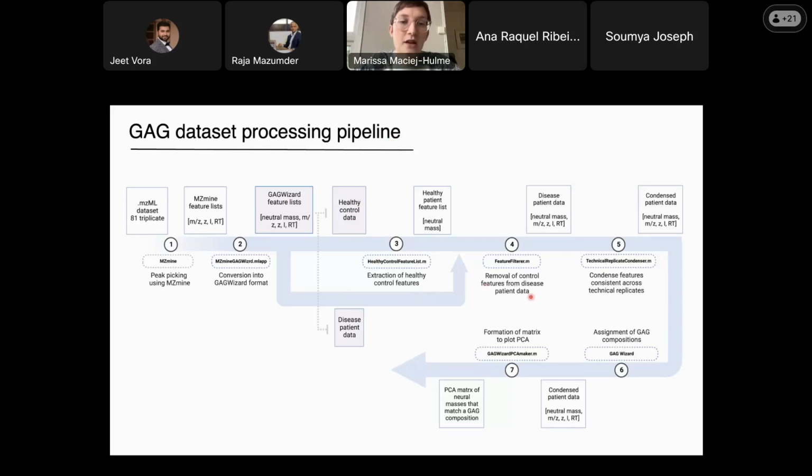So once we'd done this, we then condensed our data down. At this point, we had 3 separate runs from each patient, and we'd taken each sample to look to see if we had any injection variabilities or run-to-run variabilities. And then we also curated our data by looking at whether species were found in 2 of the 3 lists for each run for each patient. And if it was found in 2 or more, then it was kept on the list. If it was found in 1 run but not the others, then it was discarded.